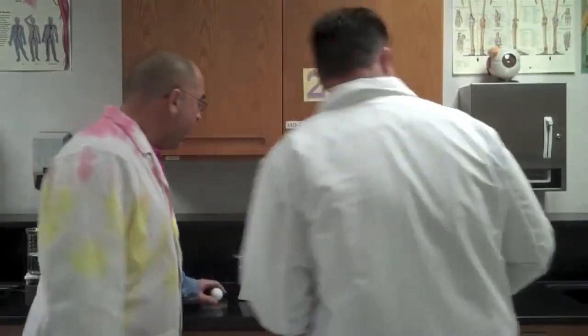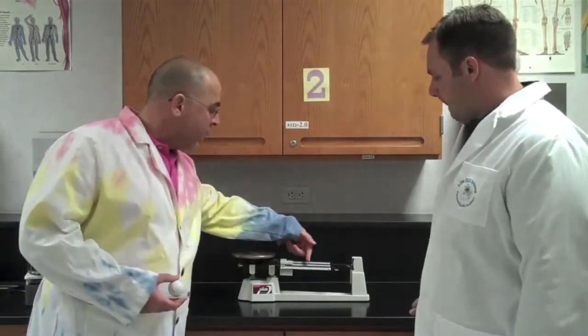So our next thing up here is we're going to show you how to measure the mass of an object using a triple beam balance. A triple beam because there's three beams - one, two, and three that you will use for the reading. And mass is how much matter is in an object. How much stuff is in something. That is mass.